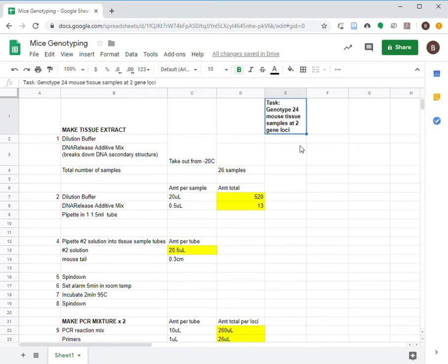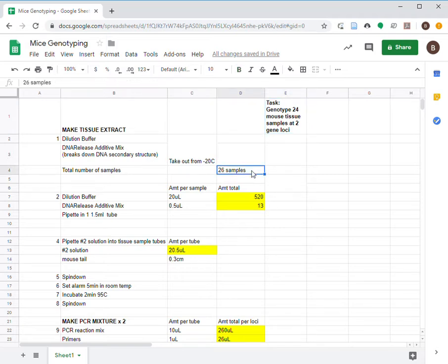A test is the genotype 24 mouse tissue samples as two gene loci. We'll prepare this for 26 samples to account for the amount of solutions lost during pipetting.